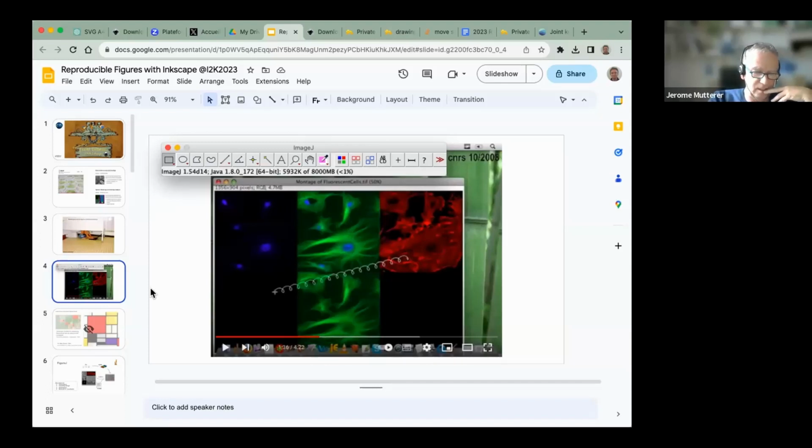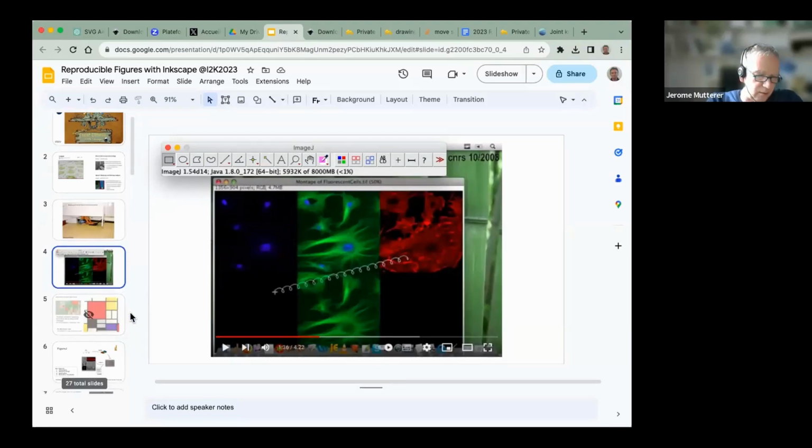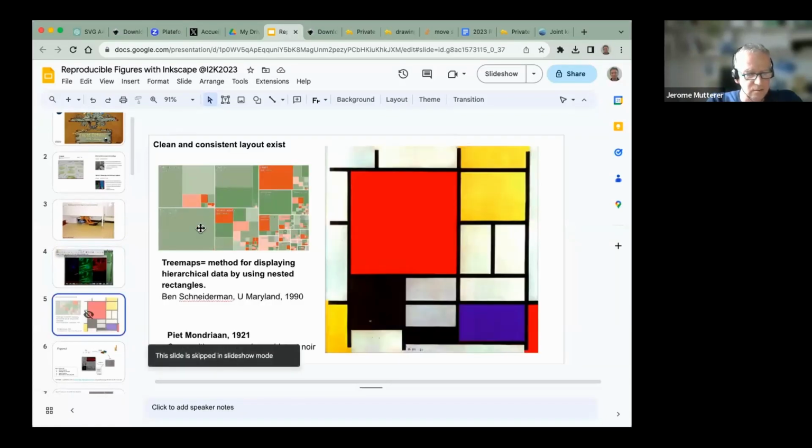So after that, I wanted to go further and address the problem of traceability of figure content. This is where I created, together with Eda Zink, a student of mine, the FigureJ plugin. FigureJ was a simple ImageJ plugin based on treemaps, considering that any scientific figure can to some extent be mapped into such a treemap structure with panels showing content.